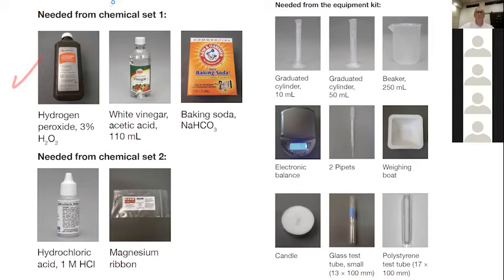It kind of strips the coating. Right, exactly. Ironically, there's going to be a thin layer of iron oxide on the steel wool, and for continued reaction to take place, they're going to have to remove that. Once that's removed, even more oxidation can take place, because you will have removed the iron oxide layer and left pure iron there for the oxygen to go in and start rusting it out.